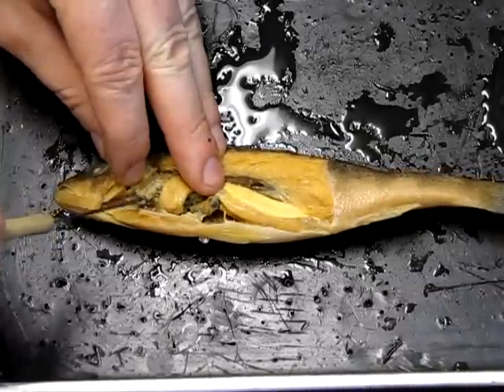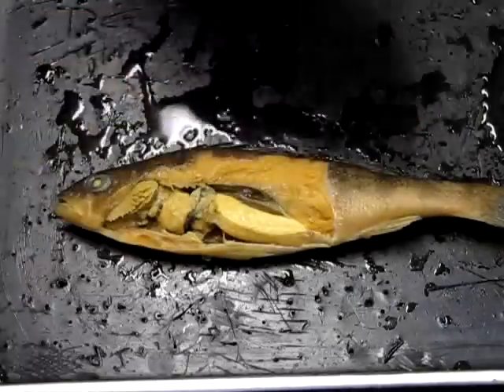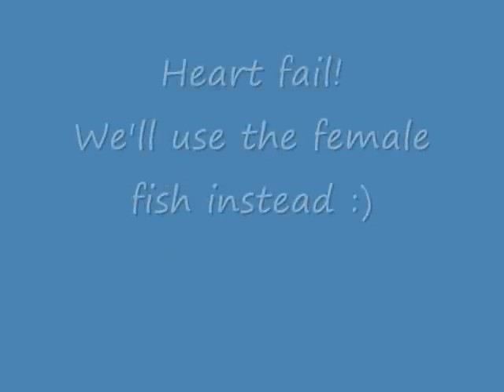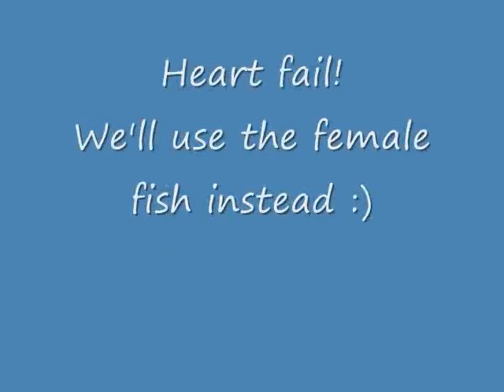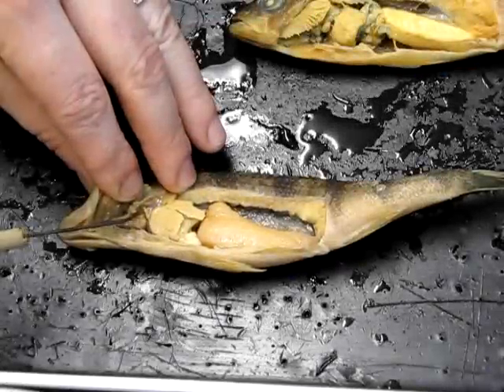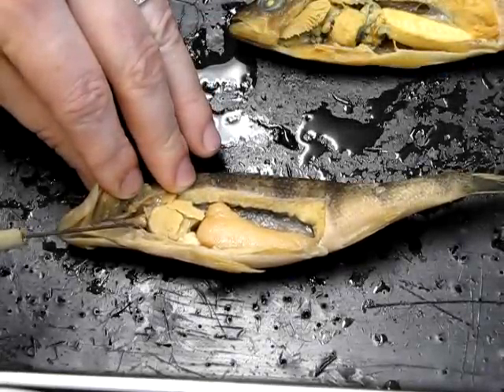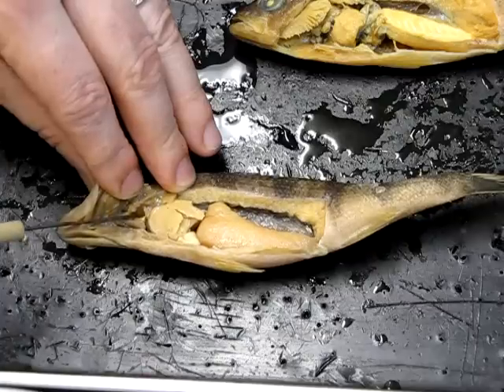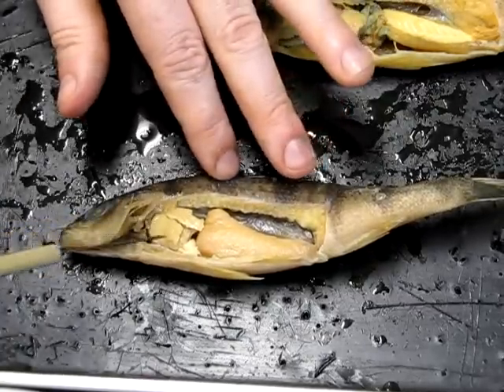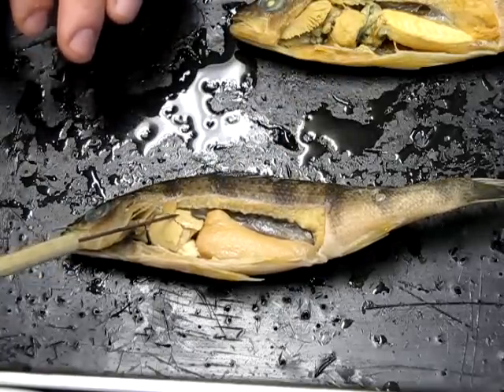The heart is easier to see in the female specimen. You can see this little structure right here — this is the heart, very small in this little fish. Lying behind the heart is this large glandular structure, which is the liver.